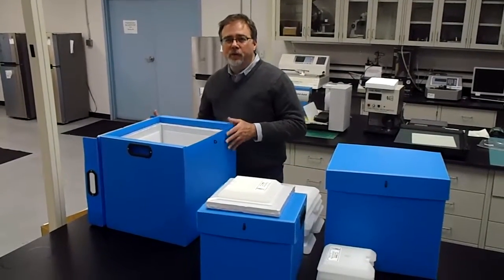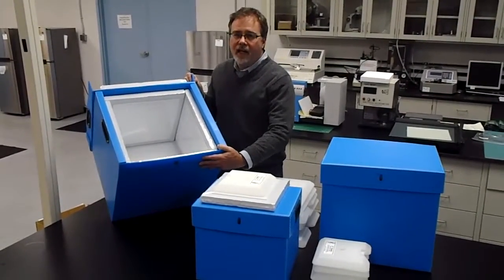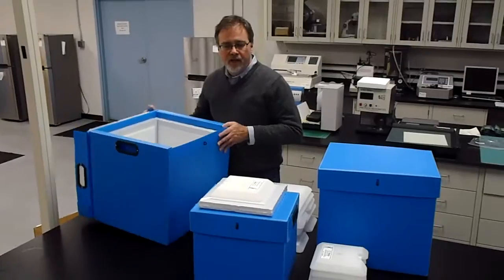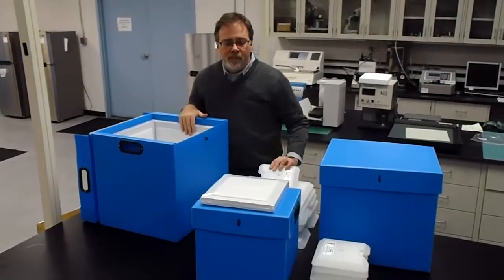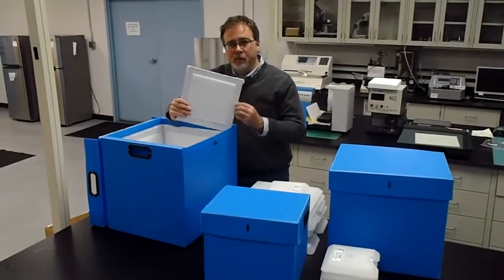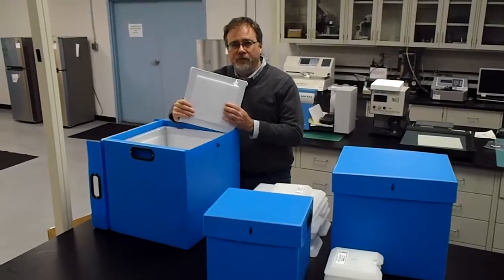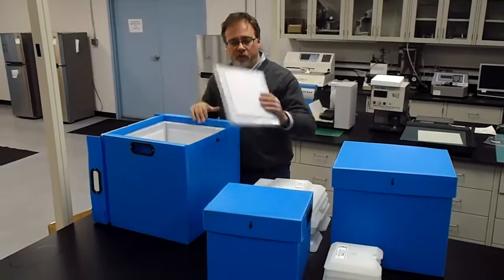Each of the shippers comes with the insulating material pre-installed inside the outer shipping container. This line uses VIP panels as the insulating material. Each of the VIP panels comes with a plastic protective wrap, along with additional padding to add further protection for the VIP panel when in use.